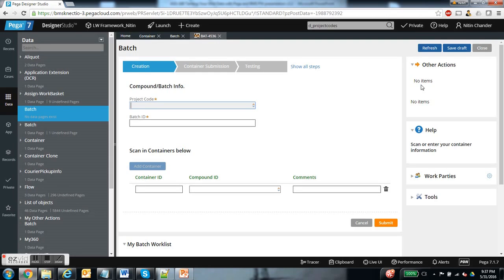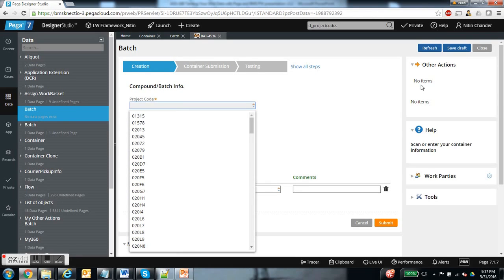So in essence, the data visualizer is presenting a visual representation of a data type, which allows me to really gain a deeper insight into how that data type is being used in my application. Let's now go ahead and create a batch and see live data in action.